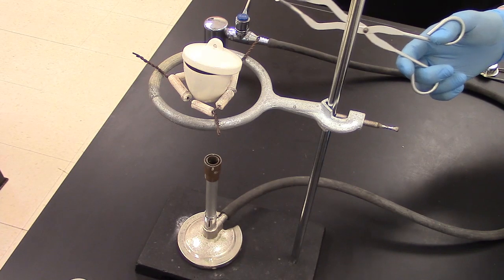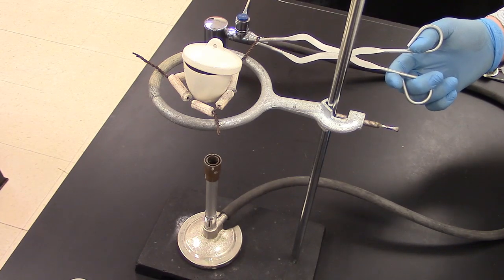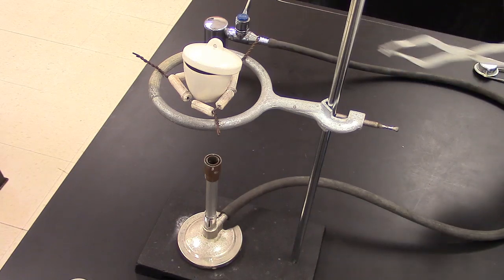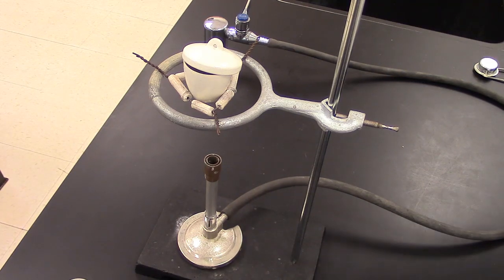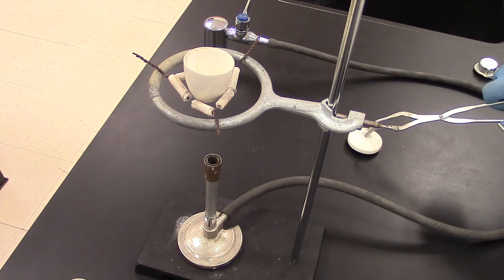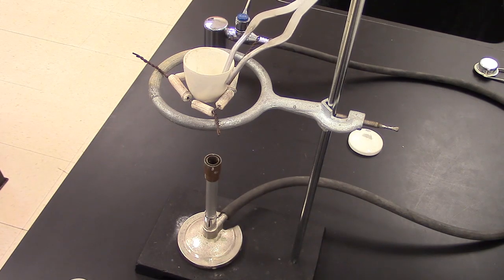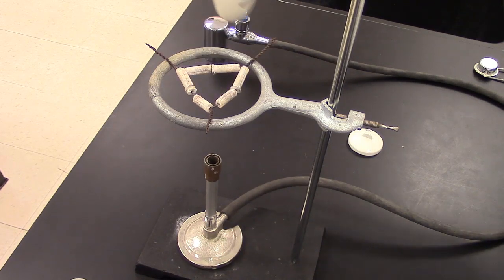When it's time to remove the crucible from the ring stand here, we're going to use our crucible tongs. Do not use your fingers. We're going to gently take our lid off with the crucible tongs and place it off to the side. And then we're going to gently remove the crucible using the crucible tongs and place it off to the side.